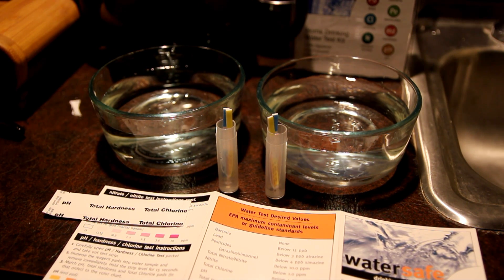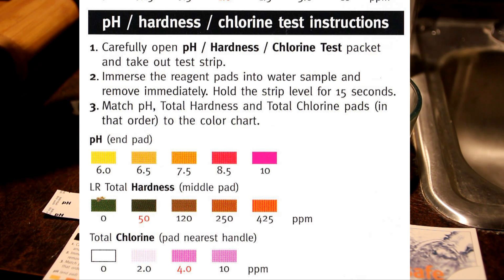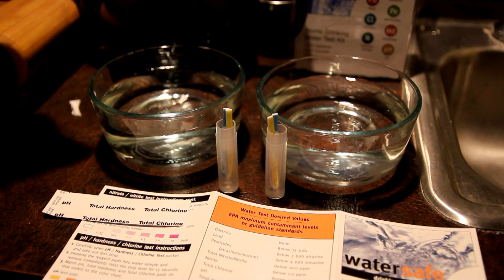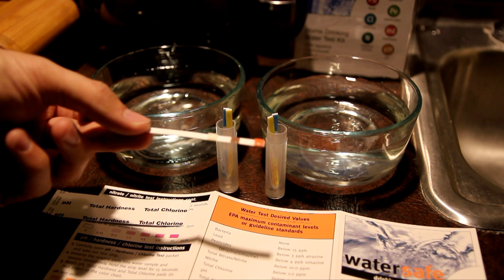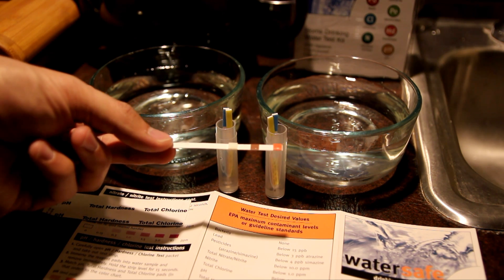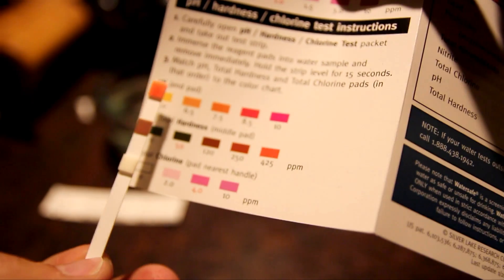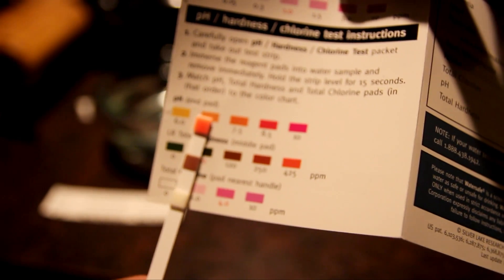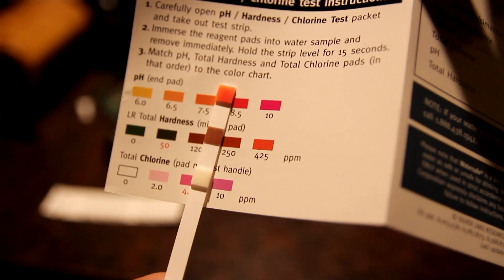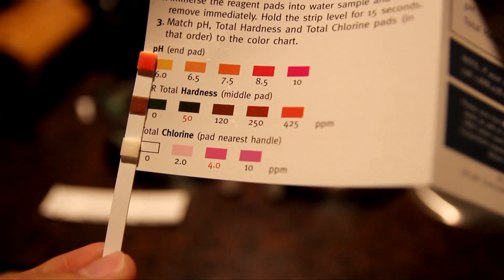The next test is hardness and pH. I open it up and test the city water first. The instructions say to immerse the pad into the water and remove immediately, then hold the strip level for 15 seconds. After 15 seconds, for city water, the pH is 7.5, the hardness is between 120 and 250, and chlorine is zero.